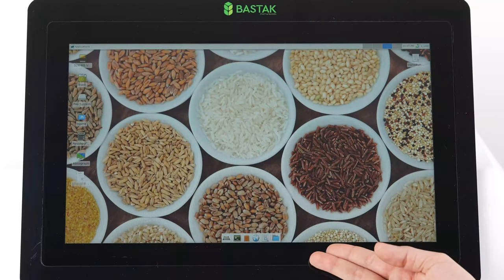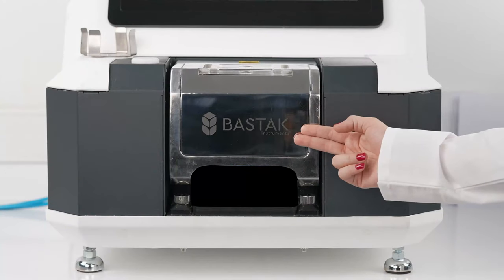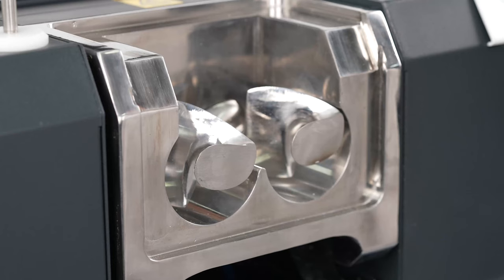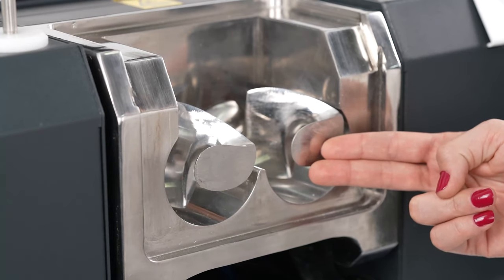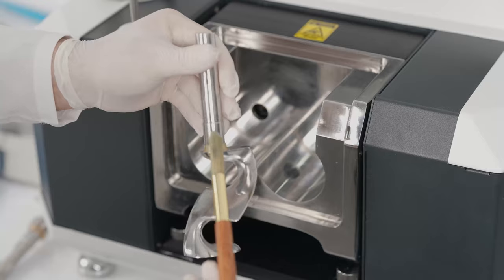The device features an LCD touchscreen 15.6-inch screen that fulfills all functions. The kneading unit is the chamber where the flour sample and kneading blades are located to perform the test. The kneading blades are specially designed mixing blades for kneading the flour sample, and they are paraffinized with a small amount of liquid paraffin before being placed in their slots.